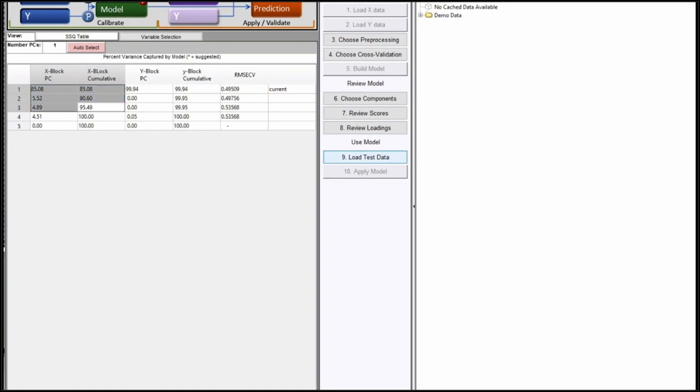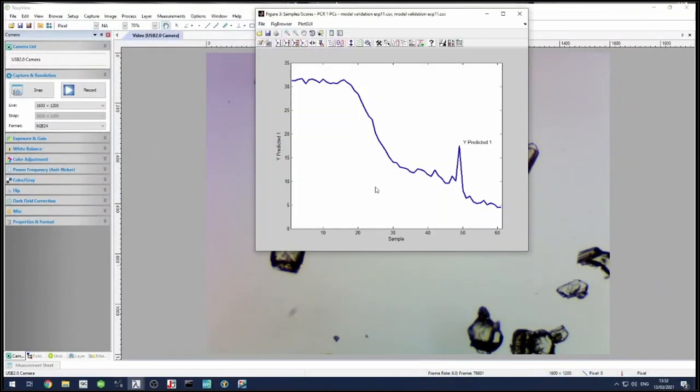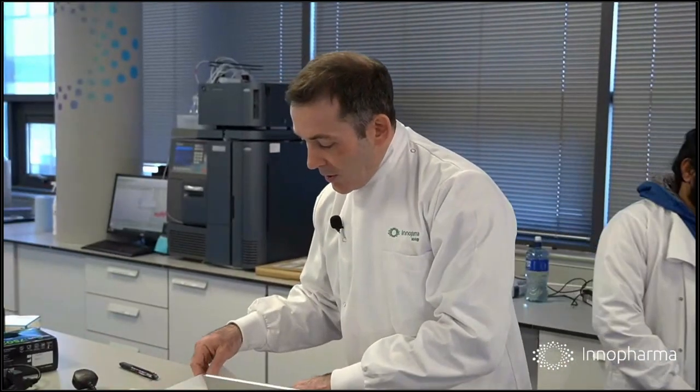Or I guess one of the bits that it left out was its sensitivity to vibration. Okay, but that's our final prediction. We expect final mass to remain in suspension of approximately 5%. So I want to go back now to the slides. Or in fact, sorry, Kieran has already worked out the measurement of the mass and so on.